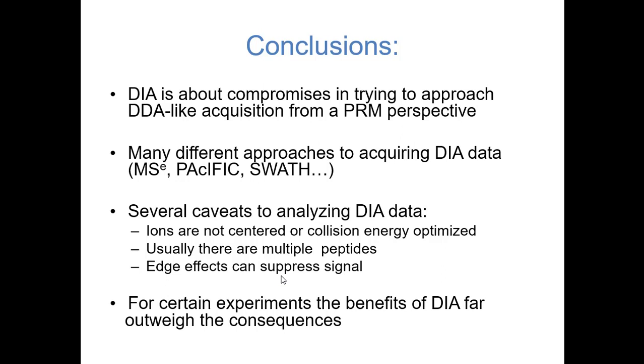That said, in the afternoon session, I'm going to show you a strategy, and you're going to get a program to take home with you that allows you to do peptide extraction as if you're doing a database search with this program called Pecan. So that'll be a take home that you can show to all your friends. It'll be great.